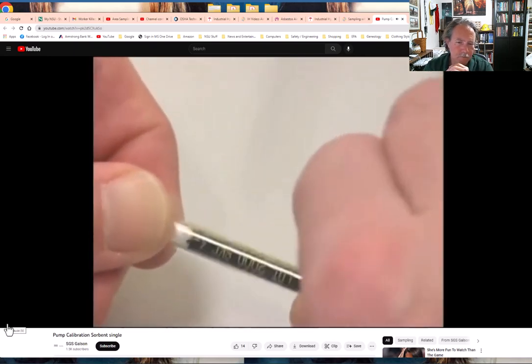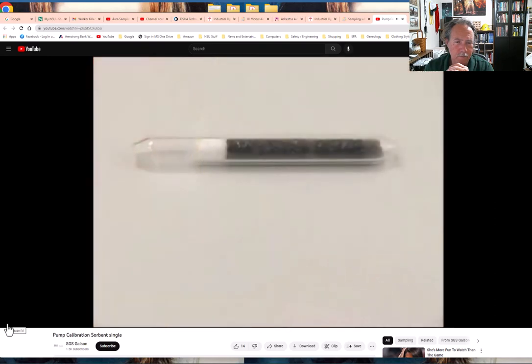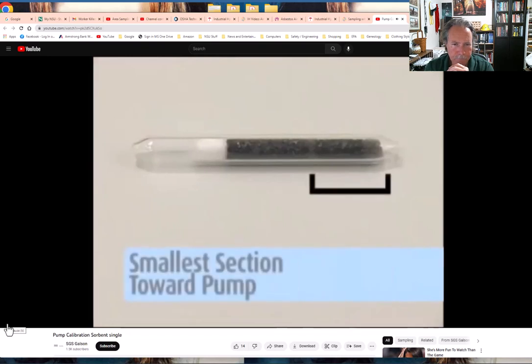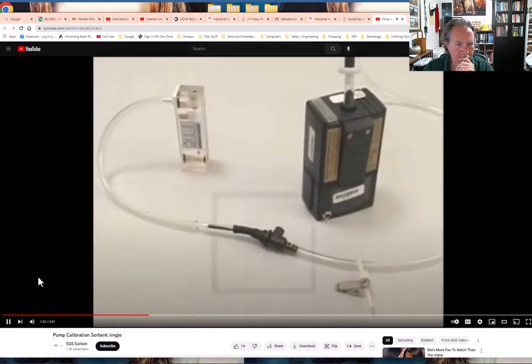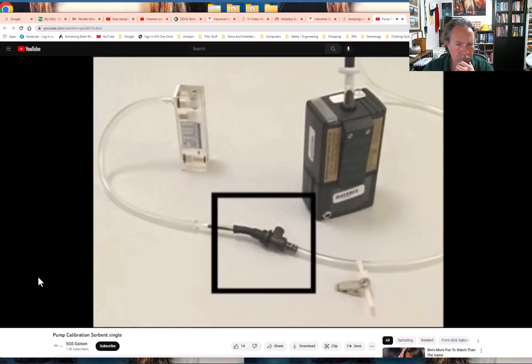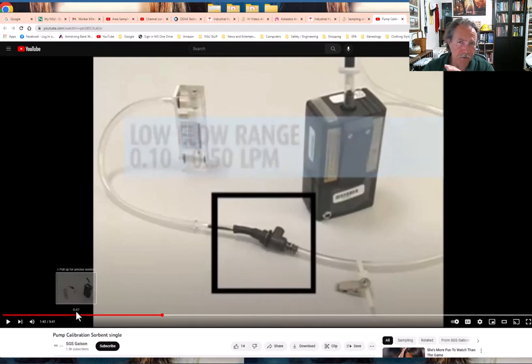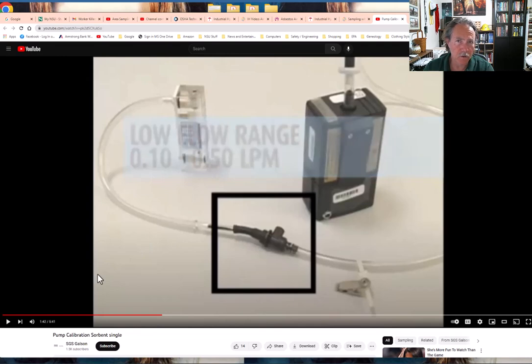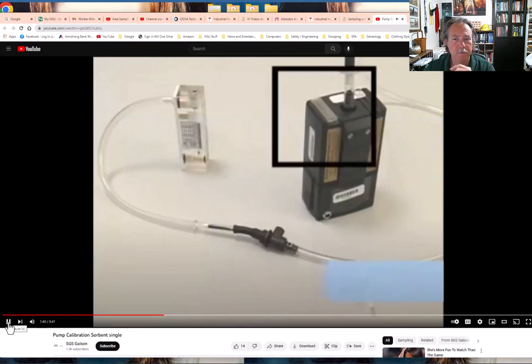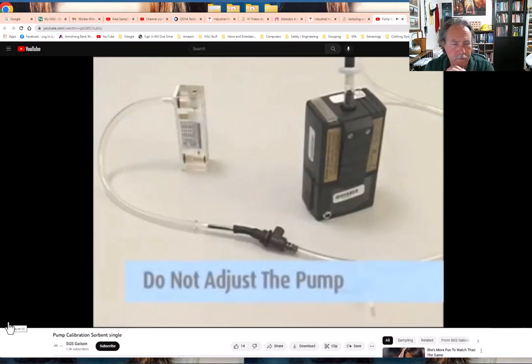Insert the open sorbent tube into the holder's rubber sleeve with the arrow on the tube pointed toward the holder. If there's no arrow, place the end with the smallest sorbent backup section into the tube holder toward the pump. Connect the rotometer to the exposed end of the sorbent tube. The adjustable low flow holder allows flow adjustments between 0.1 and 0.5 liters per minute — a big difference from cyclones and particle impactors, which run at 1.7 up to 2.5 or even 8 liters per minute.